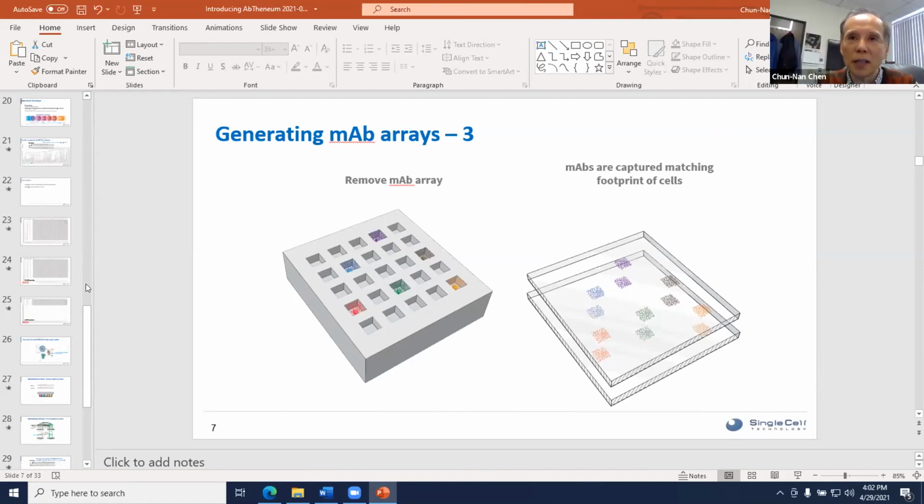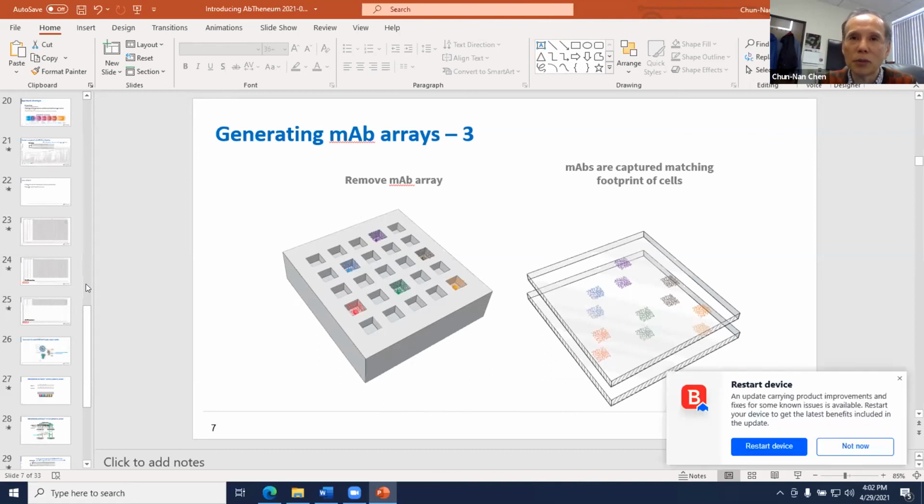We use different types of agents. A lot of times we use just off-the-shelf secondary antibody that works fine, but sometimes the project demands that they use some other binding agents, sometimes proprietary. From what I'm seeing, the secretion rate is so high that inside the wells, within 10 minutes, based on our calculation, it reaches 10 nanomolar or more.